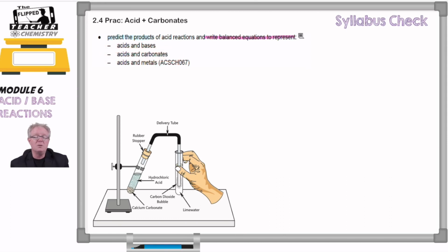We have done these. We did this little reaction when it talked about the properties of acids and bases, and we also did it in year 11. All right, and so I'm going to show a video here in a second that's from one of the year 11 modules where we were exploring the carbonates. But let's just have a look at the setup here.